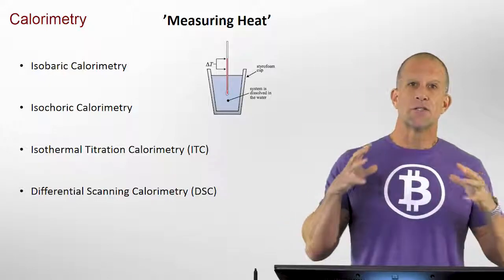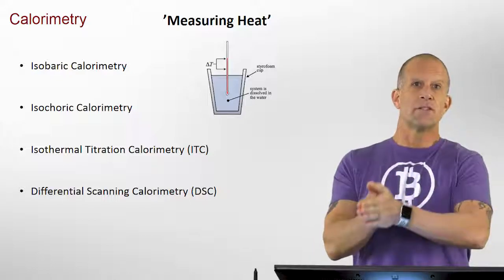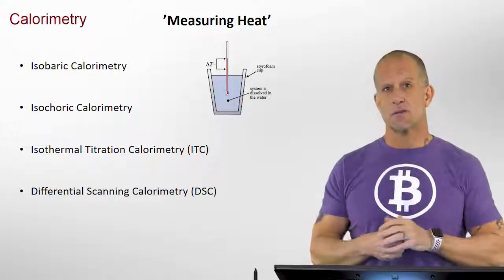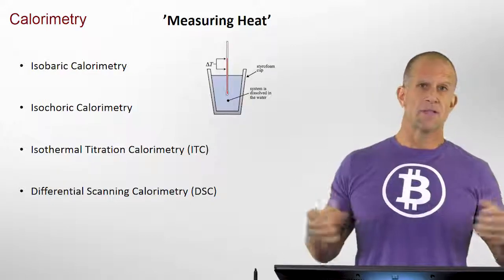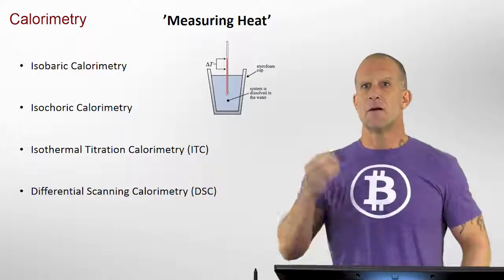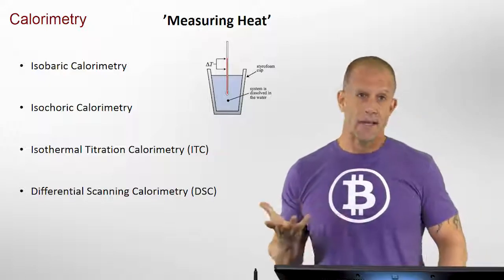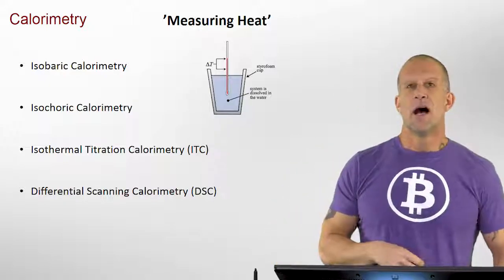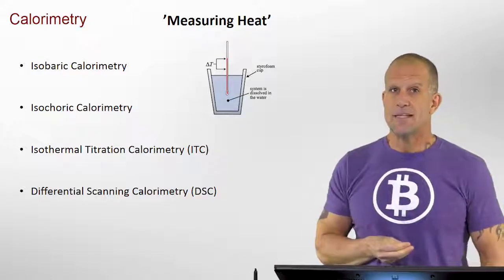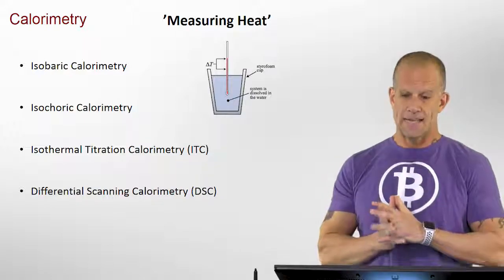And then I want to get to two techniques that are very common in research and advanced calorimetry, used a lot in the biological sciences for phase transitions, and what I would call modern calorimetry you would see in pharmaceutical industries, medical industries, and food industries today, which are isothermal titration calorimetry, we often just say ITC, and differential scanning calorimetry, which we often just say is DSC.